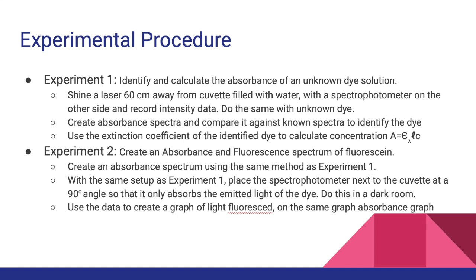We did the same thing but with a cuvette filled with an unknown dye. From there we created absorbance spectra and compared it against known spectra to identify the dye. We used the extinction coefficient of the identified dye to calculate the concentration using the given formula.